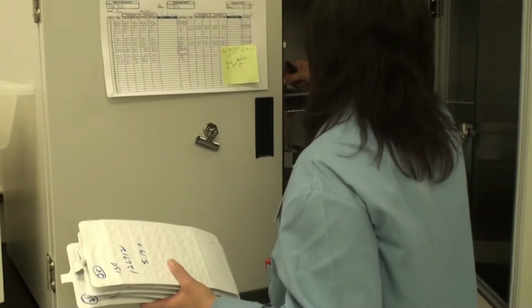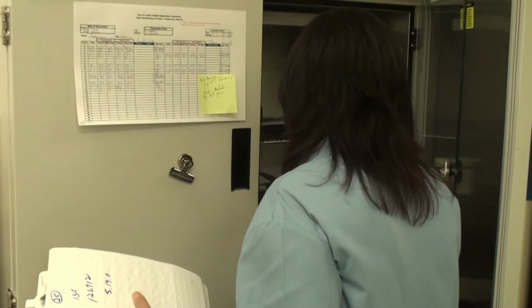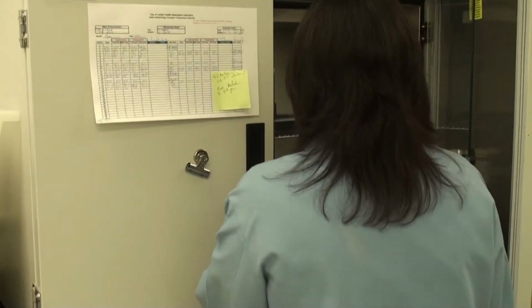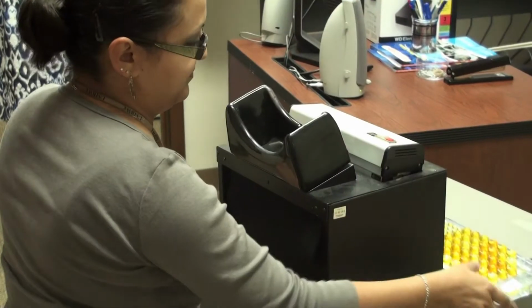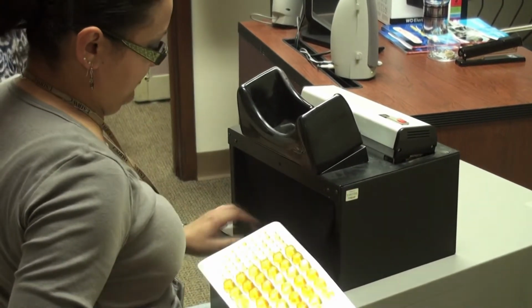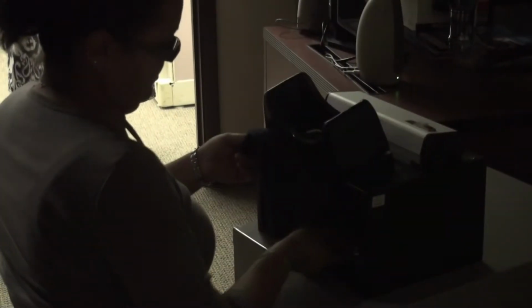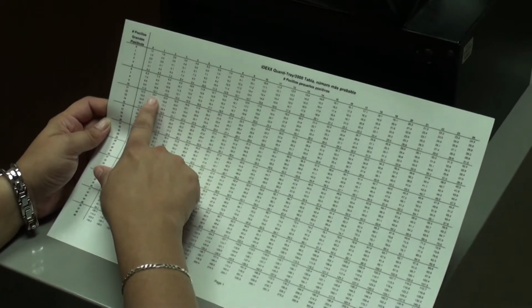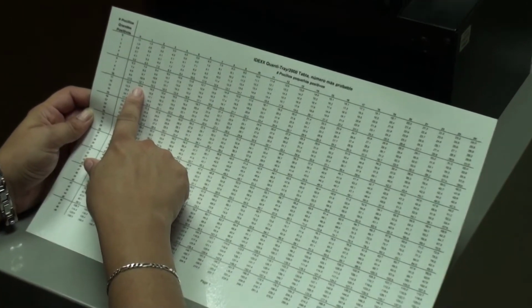The trays are incubated for 24 hours at 35 degrees Celsius. E. coli values are read by inserting the incubated trays under a UV light. Wells that glow are positive for bacteria colonies. The glowing wells are counted, and then total values of small and large wells are looked up on a statistically derived chart that gives the most probable number of bacteria colonies per 100 milliliters.